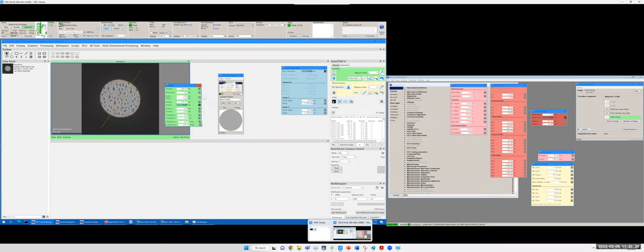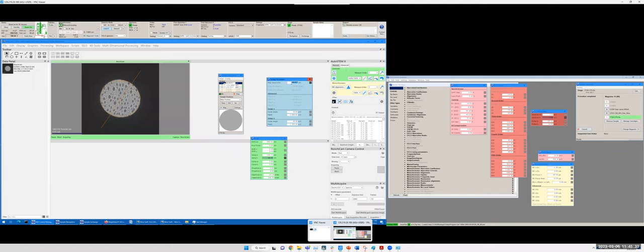Okay, we roughly tuned and then we click measure. Before we measure, I need to change the tuning parameter because the convergence time angle has changed. So I want to change it back to 70, okay? And then I click measure. You can see the gold particles being moved around. The beam is being tilted. And then you can see the values. Look at those values. If you look at the status, it's very low, like 18%, less than 30%. Okay, so this means it's bad.